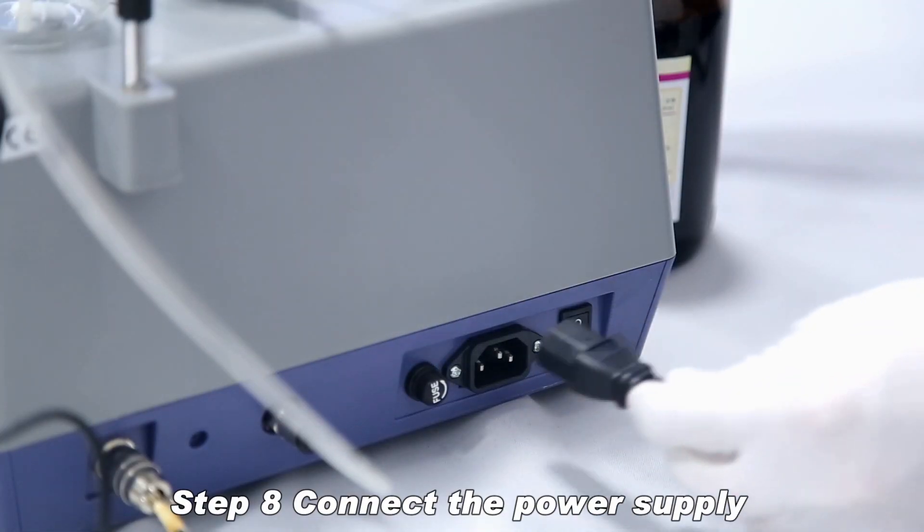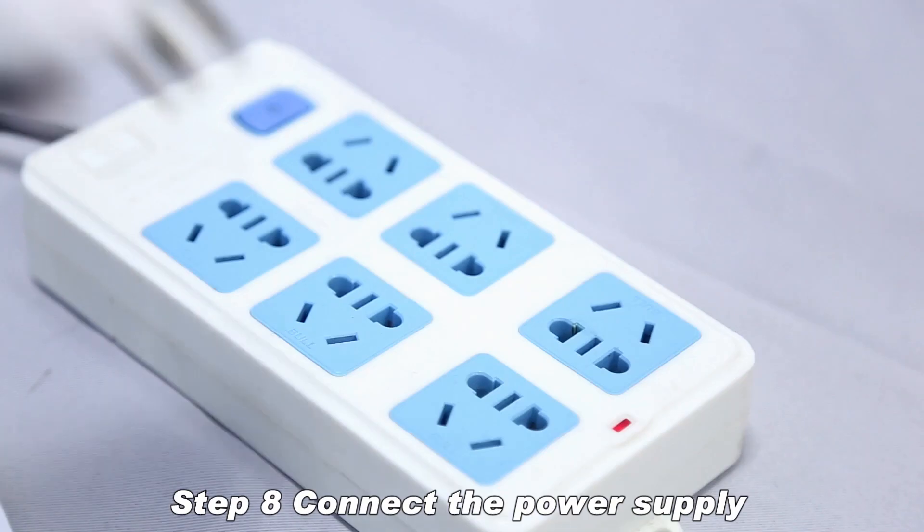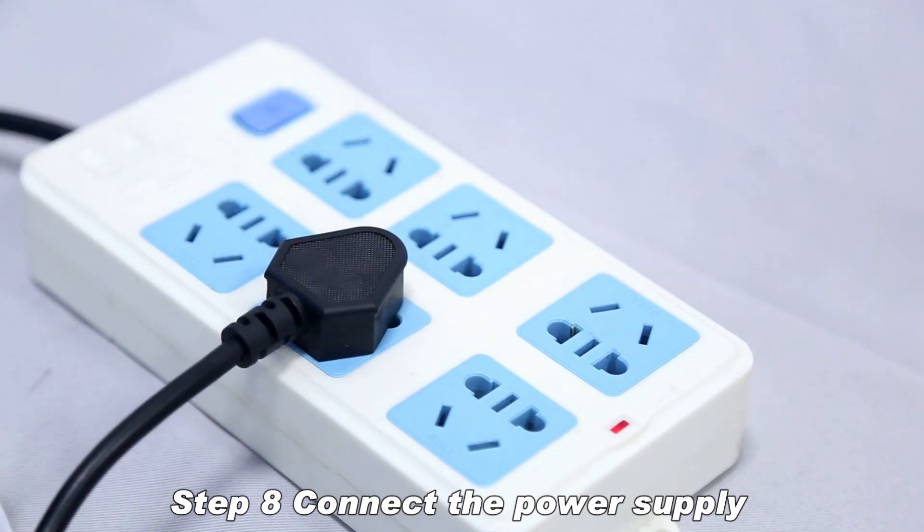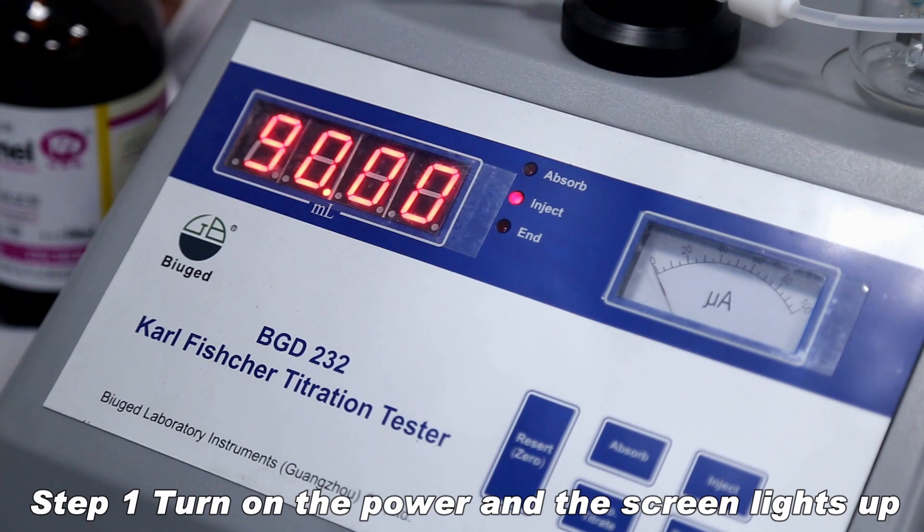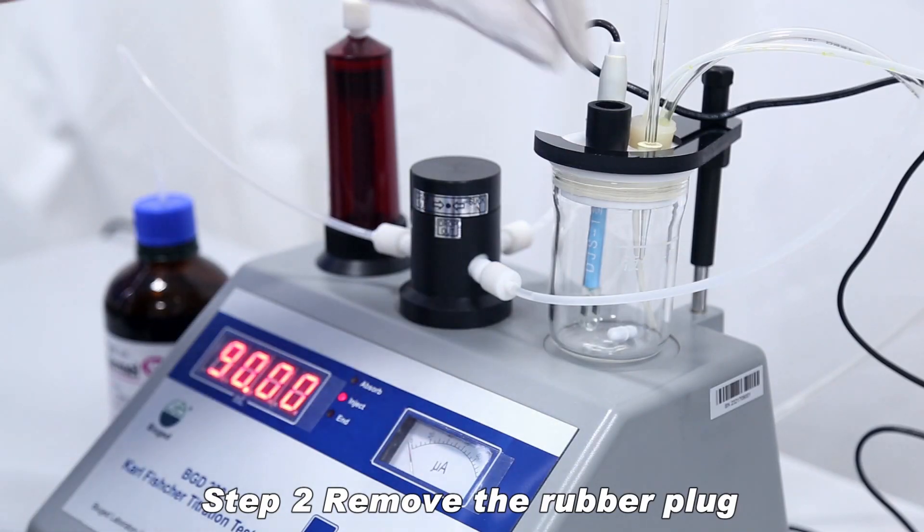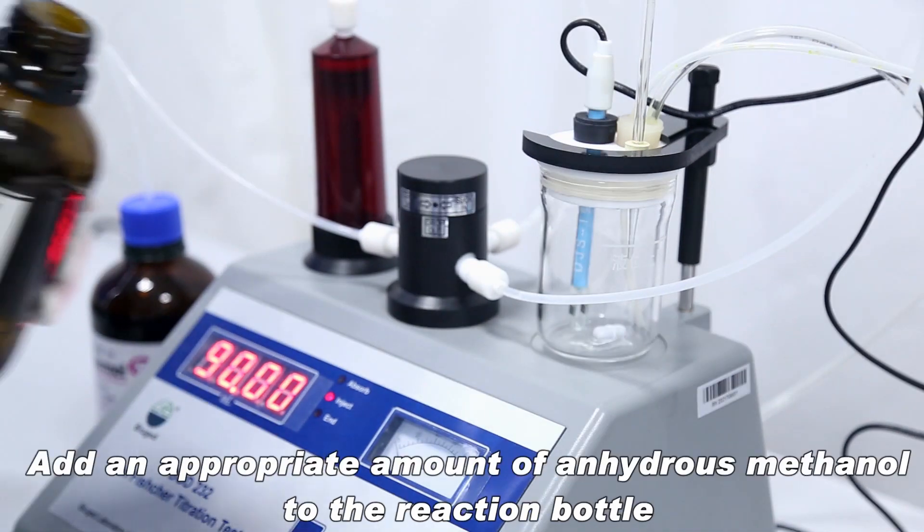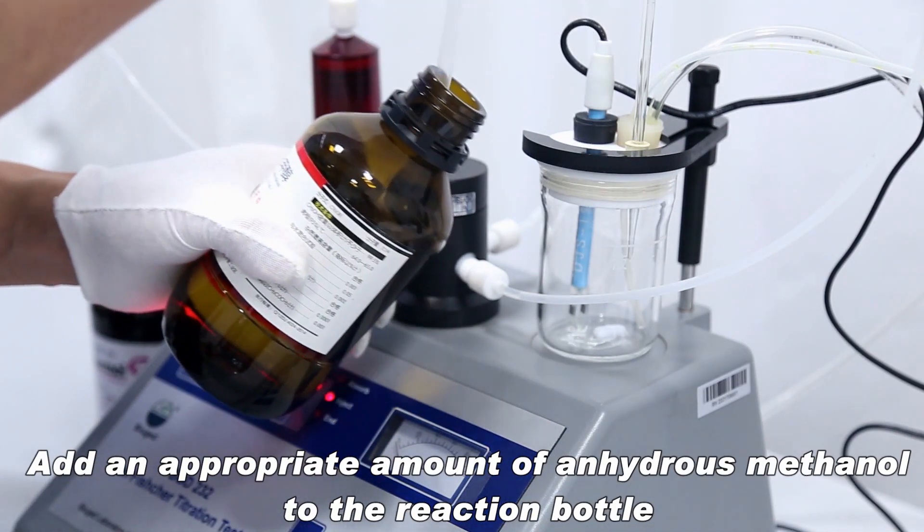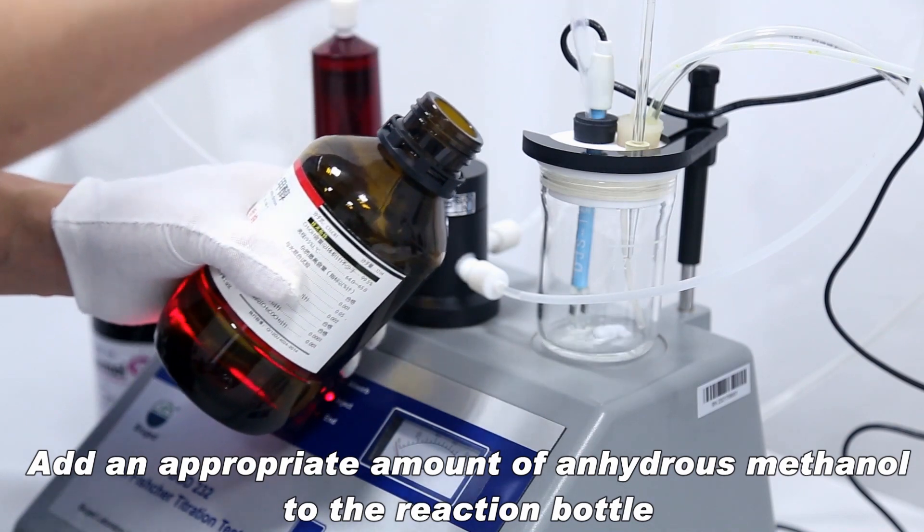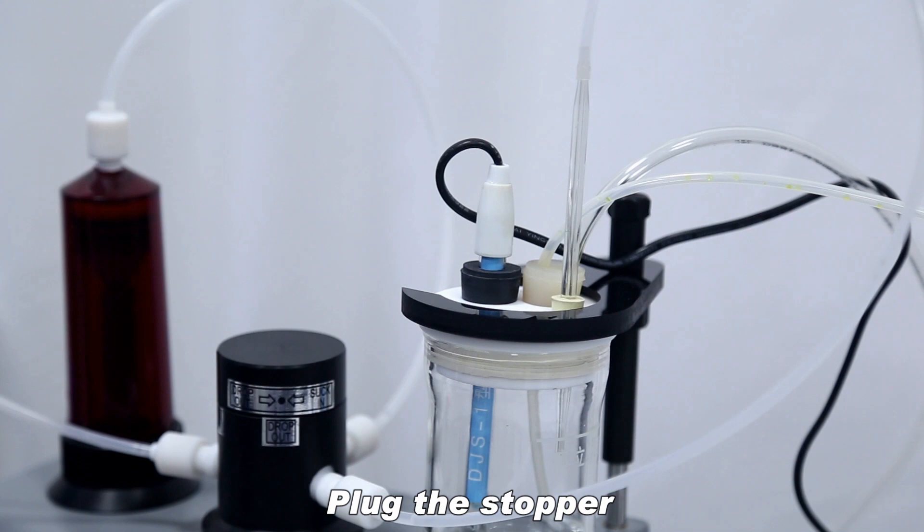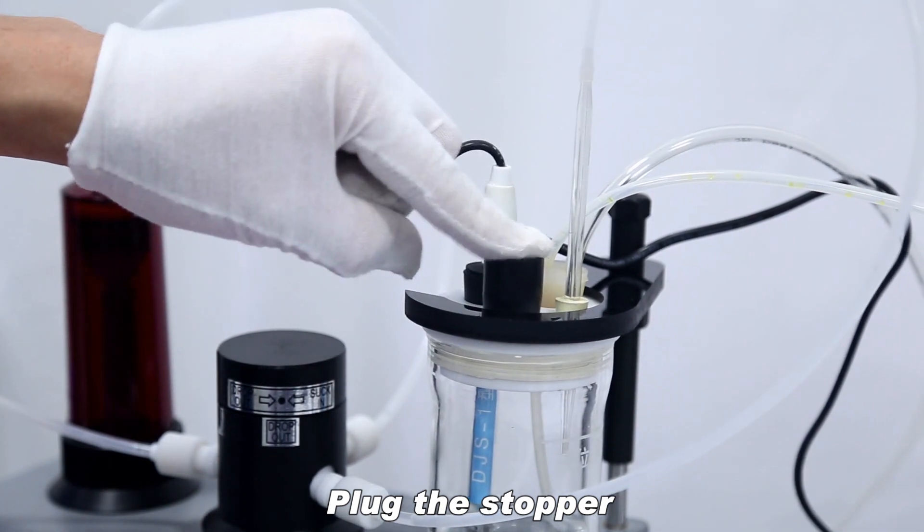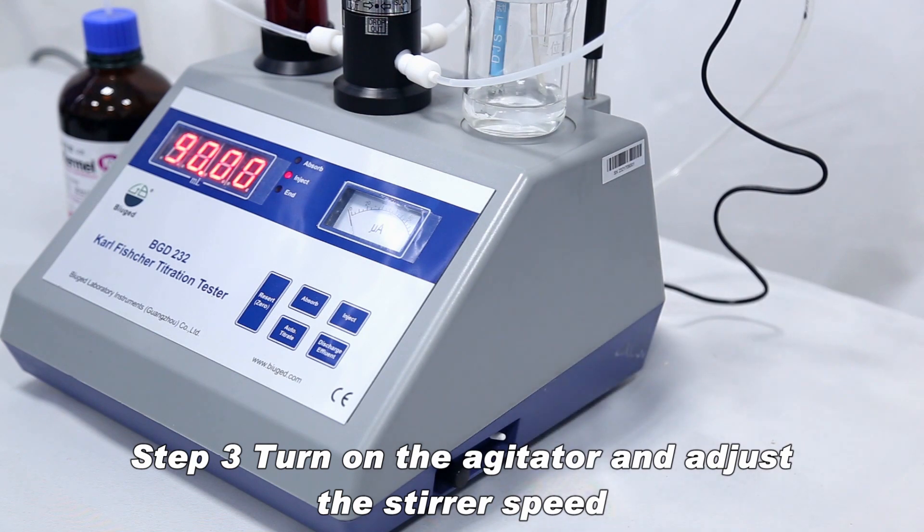Connect the power supply. Turn on the power and the screen lights up. Remove the rubber plug. Add an appropriate amount of anhydrous methanol to the reaction bottle until the electrode metal piece is immersed. Plug the stopper. Turn on the agitator and adjust the stirrer speed.